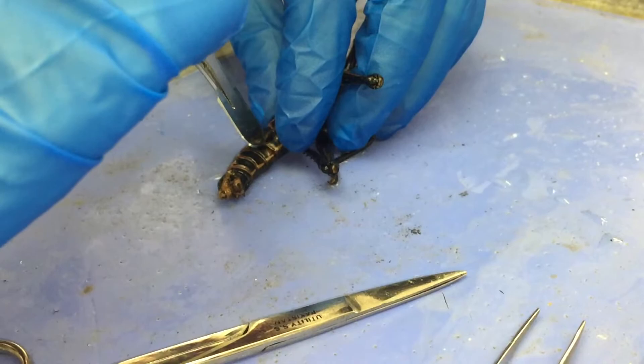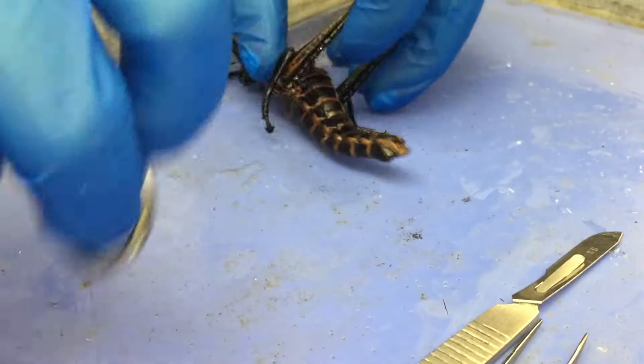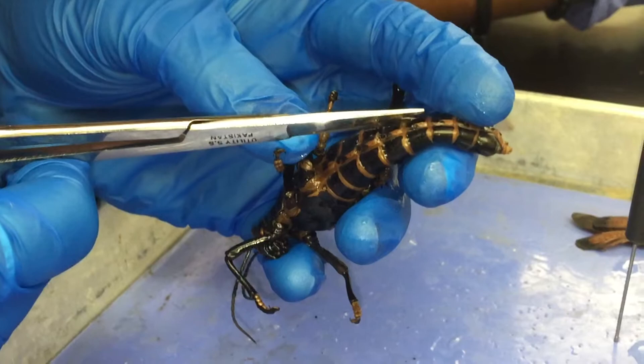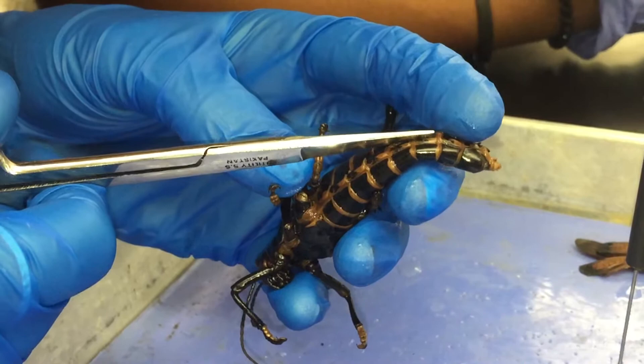There's so much water coming out! I'm going to make the decision — switching to scissors. Are these the videos you're going to send to med school for your application?